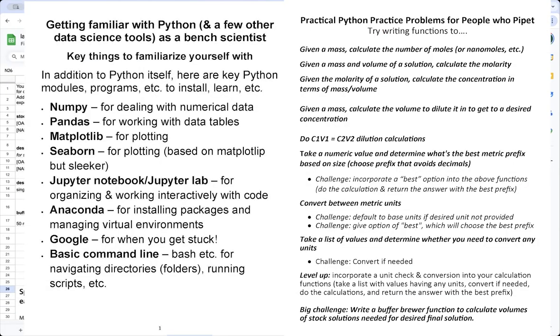Spreadsheets can be really helpful. What's even more helpful is learning how to code. And so if it was just me, I might be doing these calculations with a custom Python script or something. But when you're working with undergraduates, as well as just when you want something that you can easily see, and if maybe you don't know coding, spreadsheets are a really great tool. But I do recommend learning Python and trying to write functions to do these things for you.